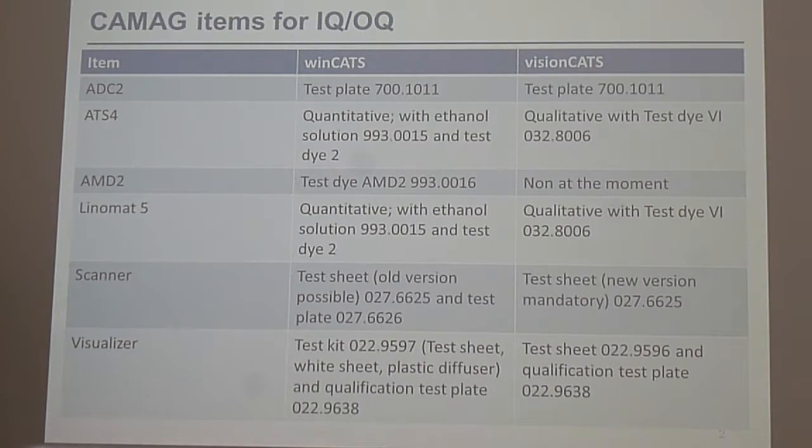It's I think 45 scans all over, and then we take out the middle one because the middle one is not used. Then we make the same calculation. There are two lines with exactly the same size. So if you have a test sheet where somebody put a little coffee on it in this area, throw it away. You can't use it.